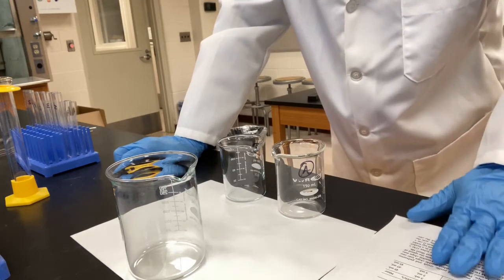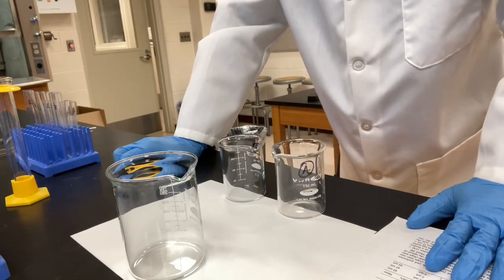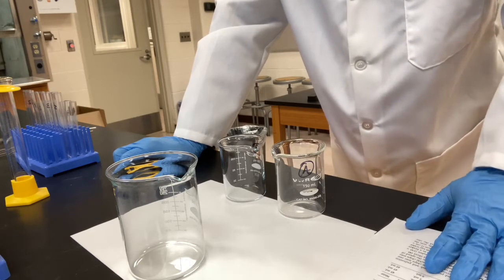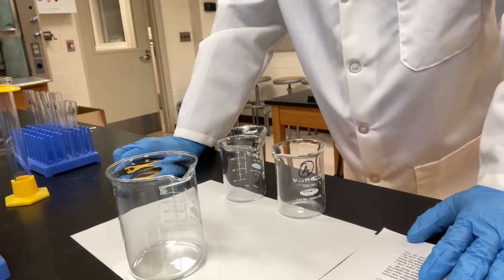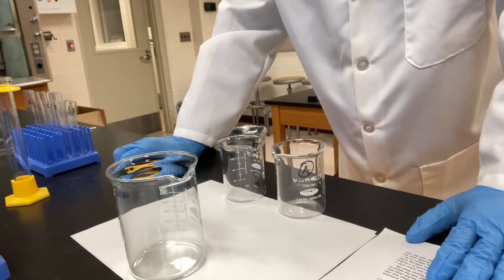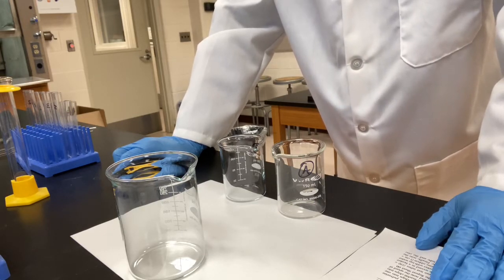Okay, 3 solutions, 3 trials we're going to make. The mixture of different solutions, different concentrations are provided in the lab manual. I'm just going to go with that. We're going to perform 3 different reactions. Each time we alter the concentration of potassium iodate.